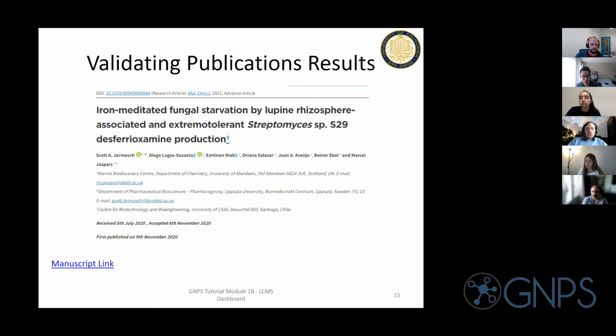But then once it's loaded, navigating around is much, much faster, on the order of a few seconds, even for these several gigabyte files. And not only do we cache it, but we also do some extra optimizations. We create an internal data structure so we can load these files much faster than the original raw mzML file. So it's not great, but it works. That's my opinion on it. Any other questions?